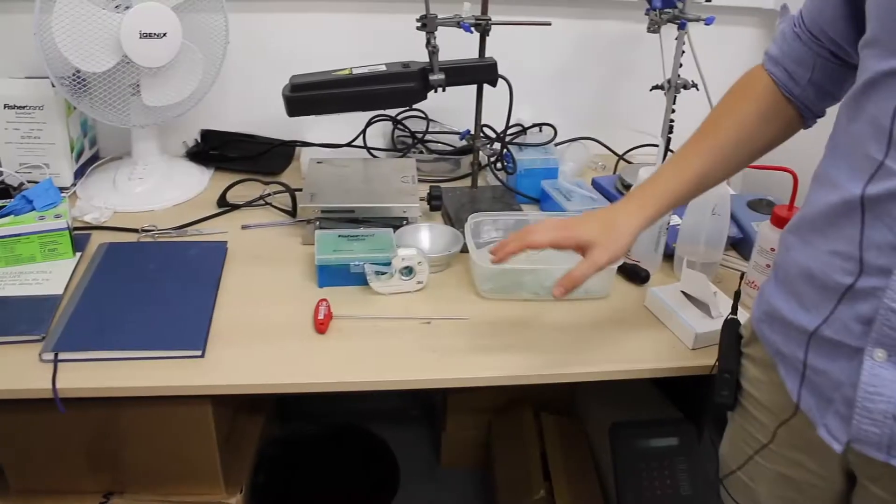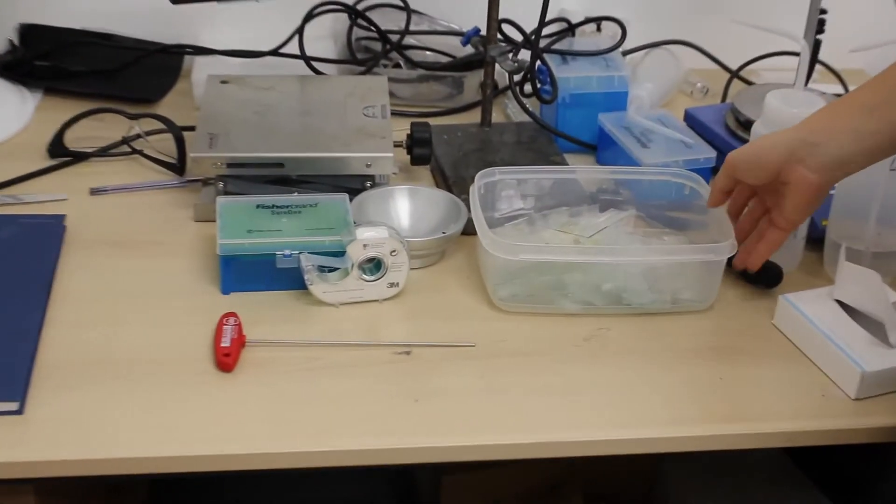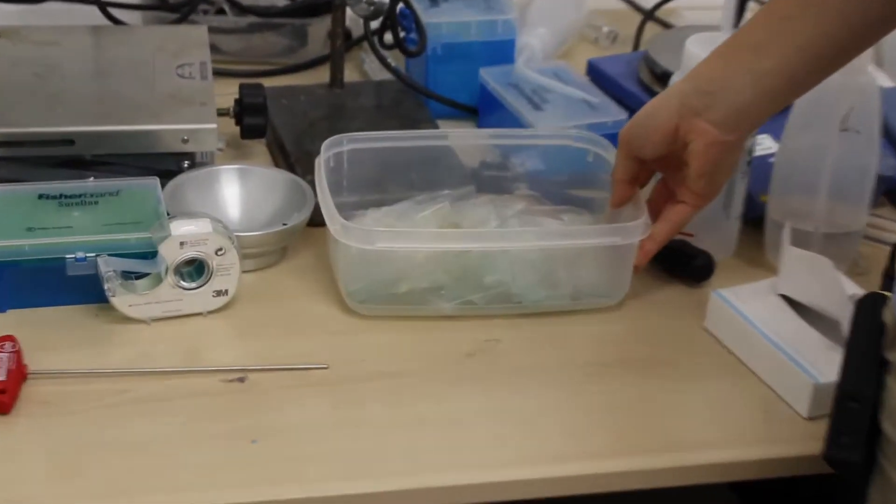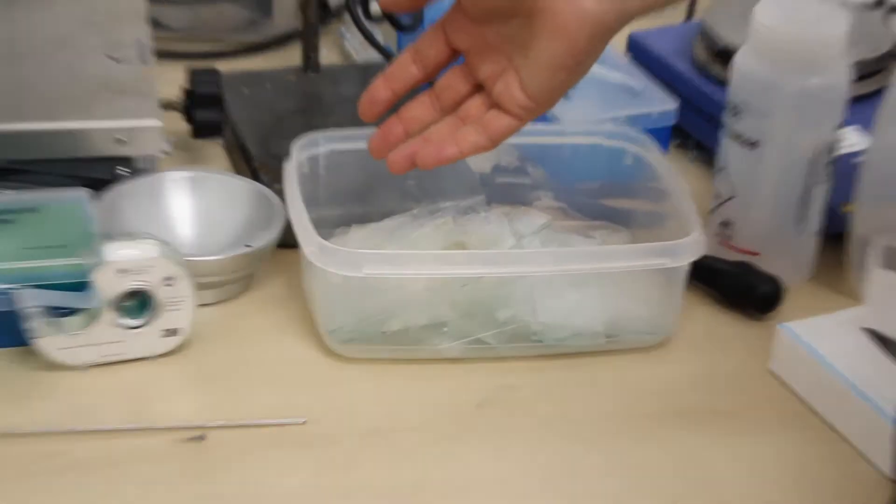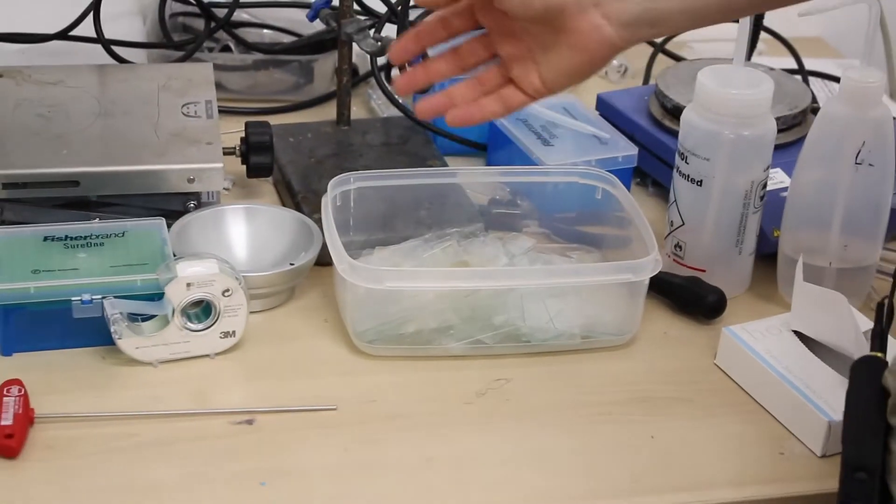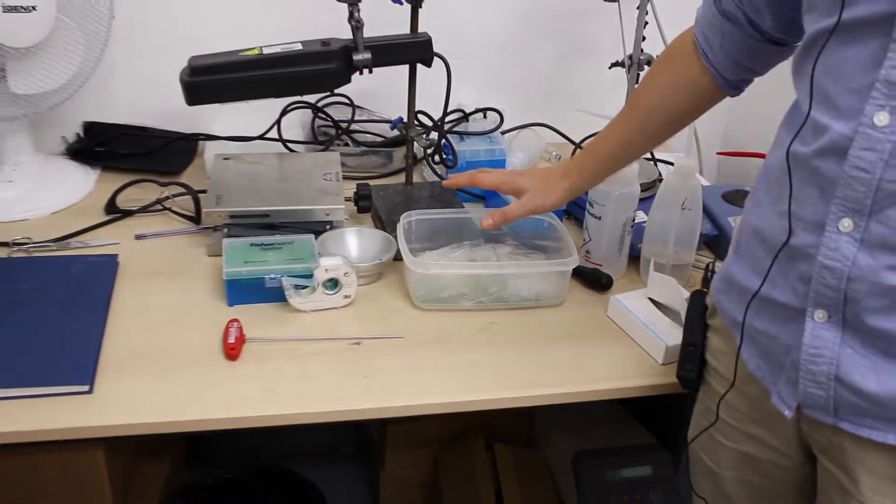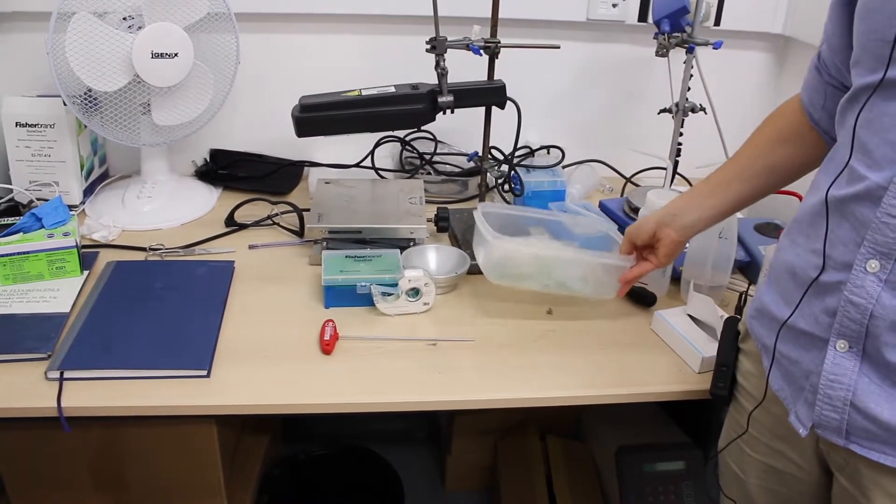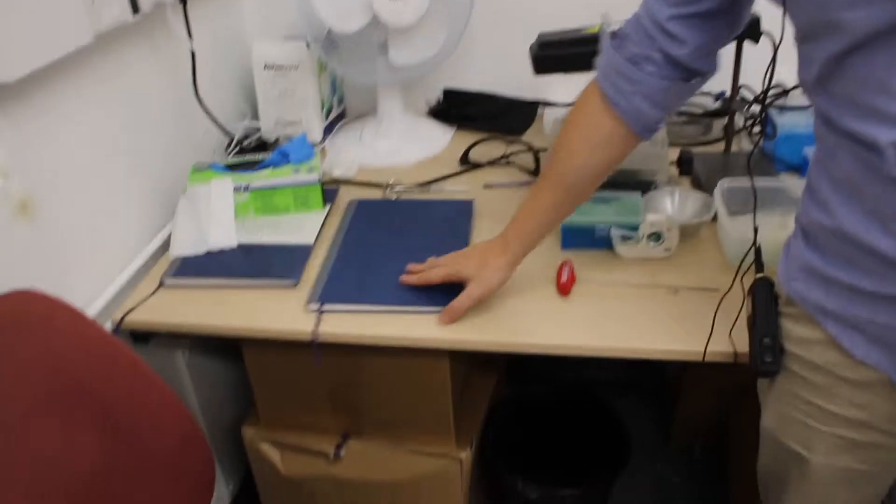So when you're done with your sample, you can just discard if it's glass in the bin. If it's plastic like a well plate, you just put it in the normal bin, but don't put glass in the normal bin, just put it here. If that is full, you can bring it upstairs and empty in the glass bin upstairs.